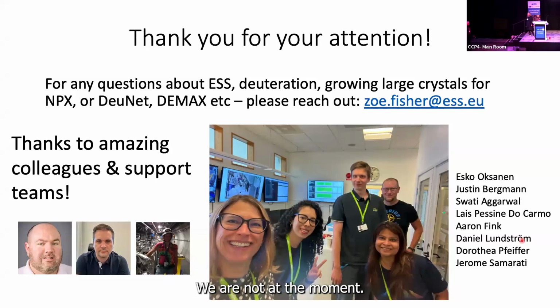We are not at the moment. It is very interesting. I visited Dean at Oak Ridge 2 years ago, and he showed me the setup they were putting on IMAGINE at the HFIR instrument. So they are testing this, and the initial measurements they've done, it seems to work pretty good. This would, of course, negate the need to deuterate your sample, which is a major pain and a cost. So if there is a way to polarize the crystal and get good data, but this has to be demonstrated for something more than just lysozyme.